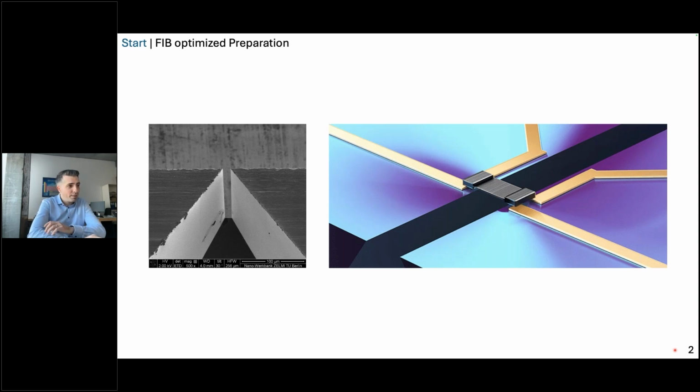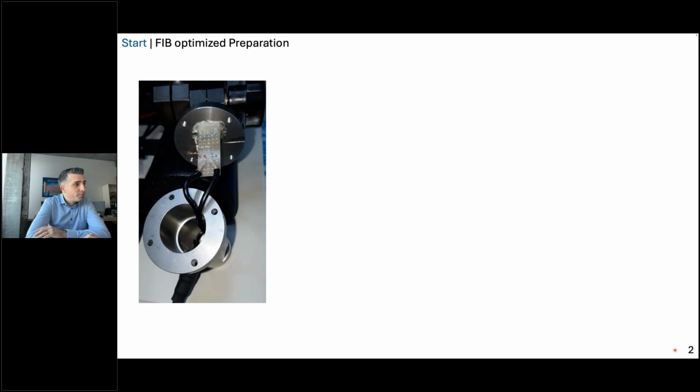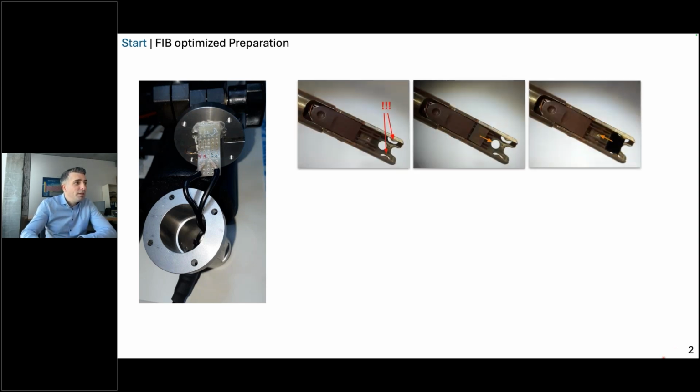At the same time the chip was developed, I got my hands on a very early version of it. I was modifying for my research an old Protochips Aduro single tilt holder to make it usable for radio frequency investigations. I thought, okay, the chip should fit in the Aduro holder. So I tried it and found out that the Aduro holder was only meant to fit with the older membrane-based chips, because the membrane-based chips were double the length, and you can grab them with your tweezers from the front and load your sample from the front. So it was not very easy for me to put these new chips into my holder, which is the base for all my research.